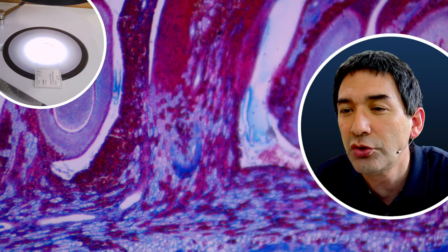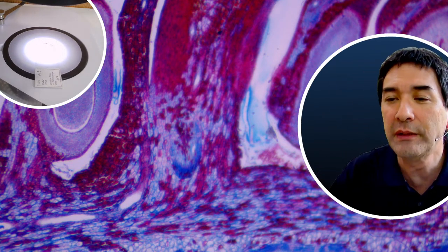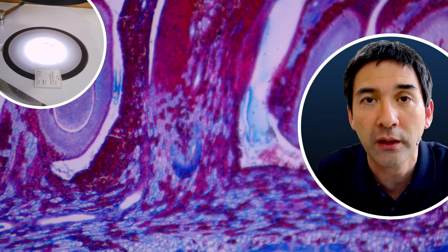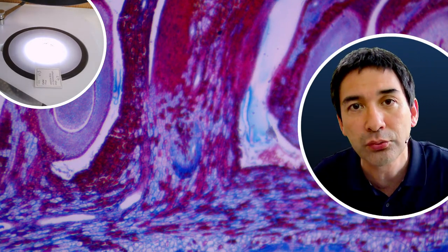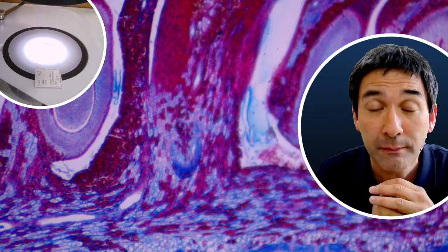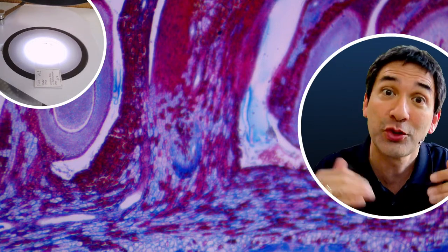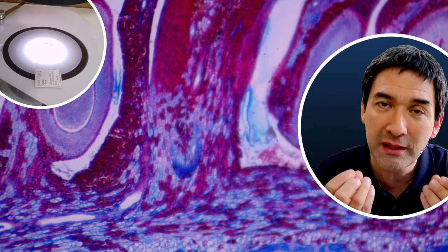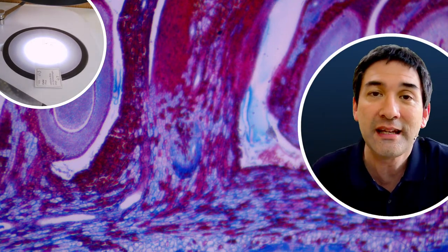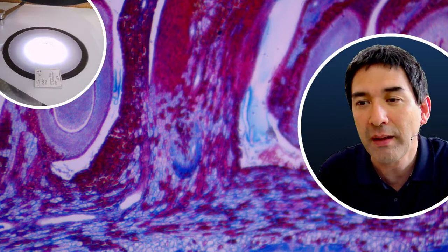Are protists visible in stereo microscopes? The short answer is yes, you can see them, but not very well. Protists are single-celled microorganisms which are fairly large, like paramecia, for example. You can see them but not very well because they're kind of transparent. The thing that really makes protists interesting is if you actually look into the cell. So stereo microscopes are not really ideal for that.